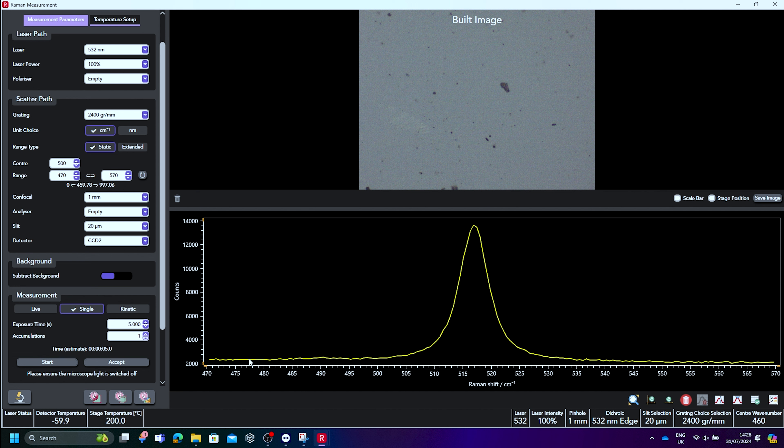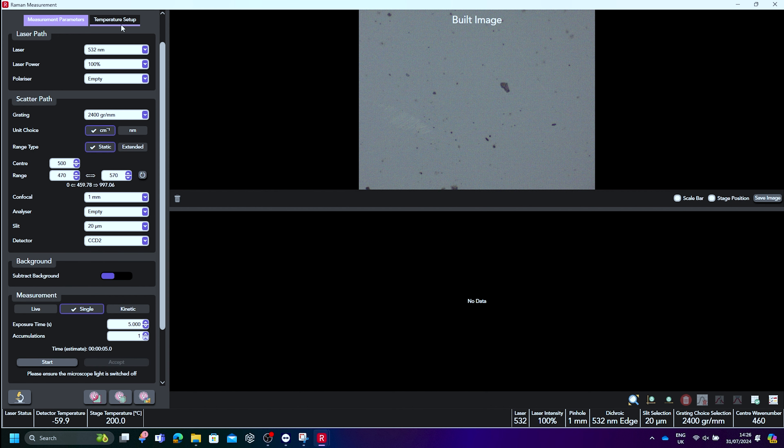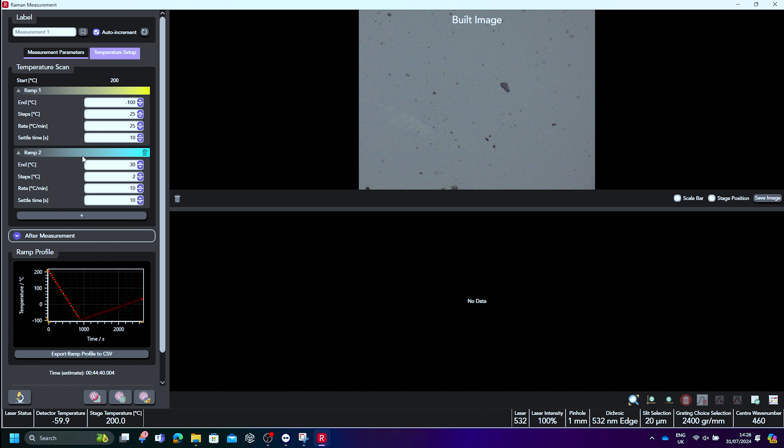In the temperature setup tab, we can set the end temperature, the number of steps between the beginning and end points, the rate at which the temperature changes, and the settled time between reaching the temperature required and performing the Raman measurement. This temperature scan is set to run from 200 to minus 100 degrees Celsius, and record a Raman spectrum every 25 degrees Celsius after a settled time of 10 seconds.